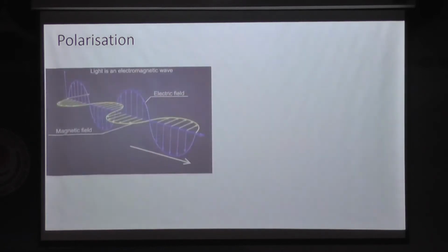The second type is polarization. The first type, bright field, is always used for stained specimens. Polarization is the second contrast type we are discussing. What is polarization?